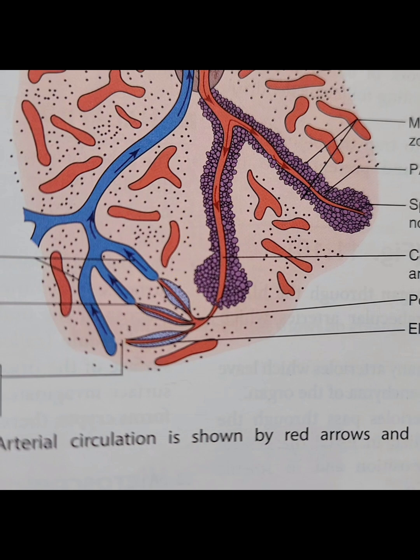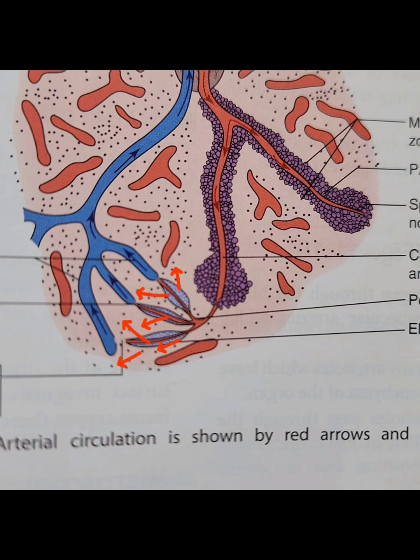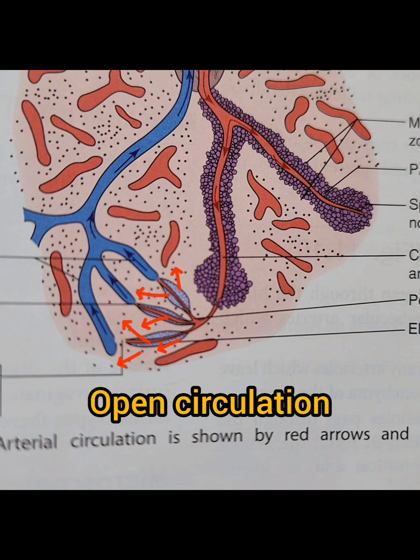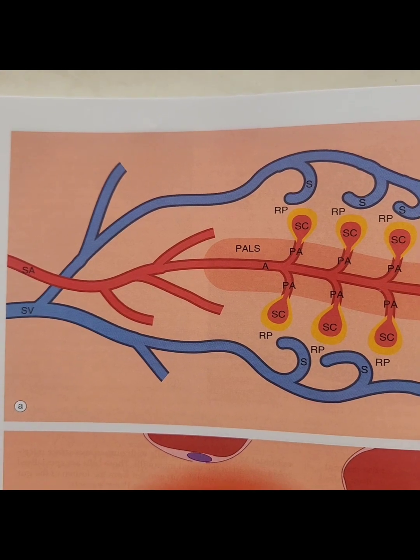These capillaries can drain the blood directly into splenic sinusoids as part of closed circulation, or filter the blood to throw it into the loose part of red pulp as part of open microcirculation, which exists in human beings. For understanding, we will look at one more picture.